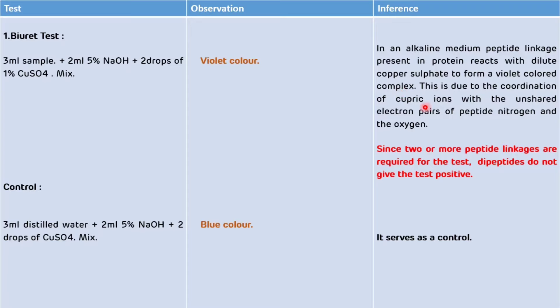This violet color complex is due to the coordination of cupric ions with unshared electron pairs of peptide nitrogen and oxygen. Now we have to do the control test. In the control test, take 3 ml of distilled water instead of sample, add 2 ml of 5% NaOH and 2 to 3 drops of copper sulfate, and mix it properly. The development of blue color indicates the control.